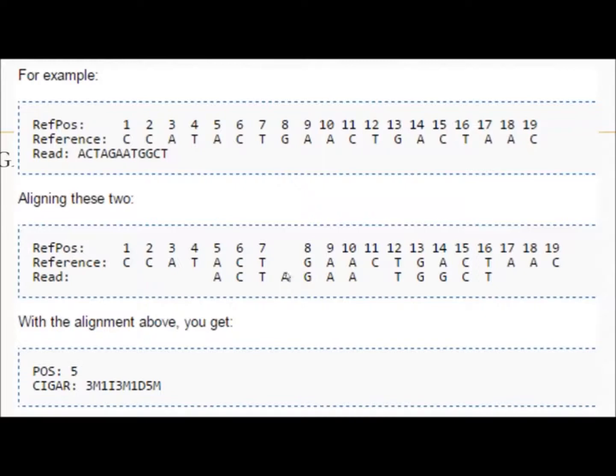That means that there is an insertion. I stands for insertion, and there's one nucleotide. I keep saying residue; it means nucleotide. One nucleotide is inserted. Then we have three matches: 1, 2, 3.